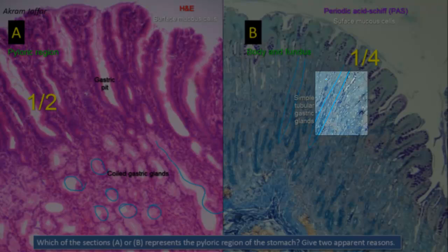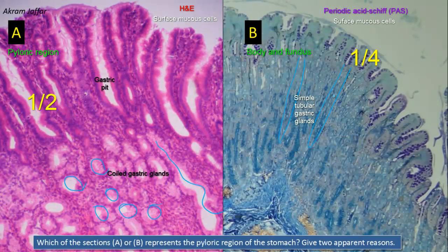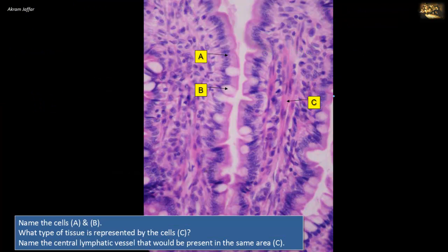Parietal cells are abundant in the fundus and body of the stomach. Name the cells A and B, and identify what type of tissue is represented by cells C, naming the central lymphatic vessel present in the same area C. This is a longitudinal section of an intestinal villus. It is lined by simple columnar epithelium in which the enterocytes, the most abundant cells marked by A, are the main absorptive cells. They have surface microvilli seen as a brush border, clearly visible in this light microscopy section. Scattered among the enterocytes A are goblet cells indicated by B.